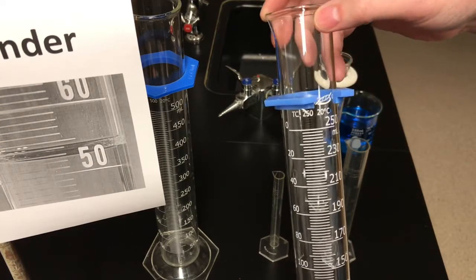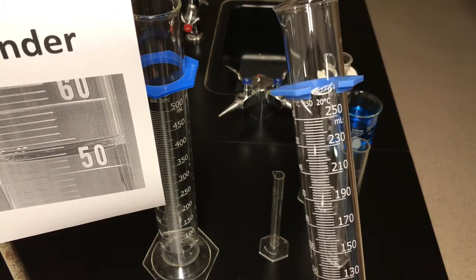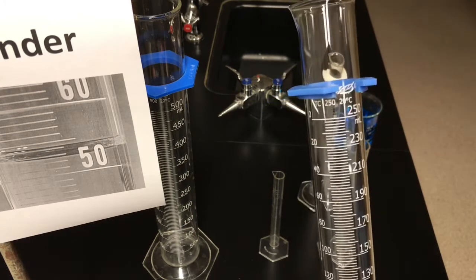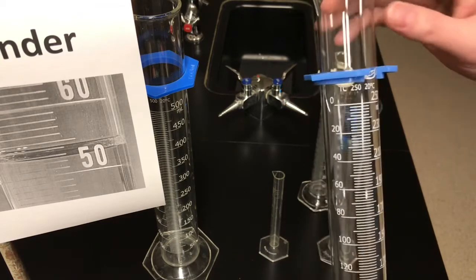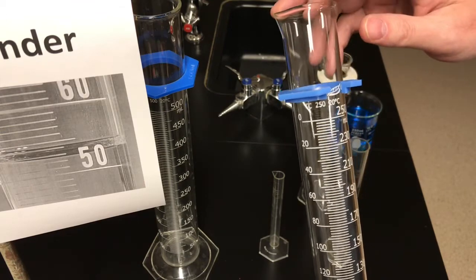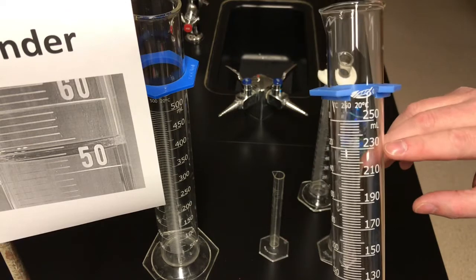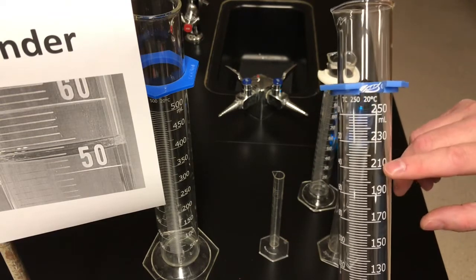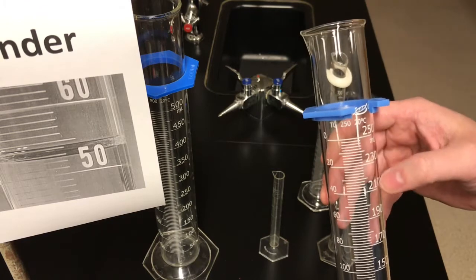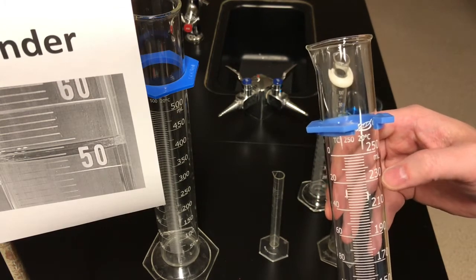Here's a slightly smaller cylinder — this one's a 250 mL graduated cylinder, meaning that's the maximum volume it can measure. Notice that graduated cylinders are often labeled with a temperature value: this one says 20 degrees Celsius, meaning it's most accurate when the volume is read at 20°C. It also says TC, meaning it's designed to measure how much liquid is contained in the cylinder. Its major scale — from 210 to 230 or 230 to 250 — is 20 milliliters. Again, there are 10 spaces, so 20 milliliters divided by 10 gives a minor scale of 2 milliliters.